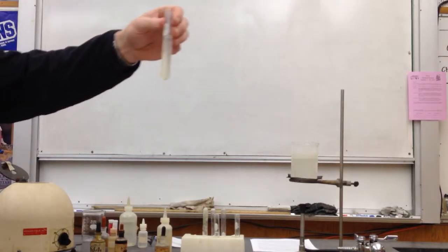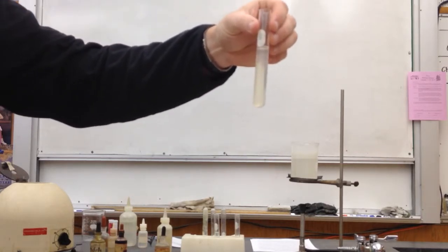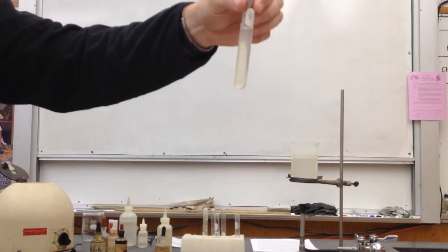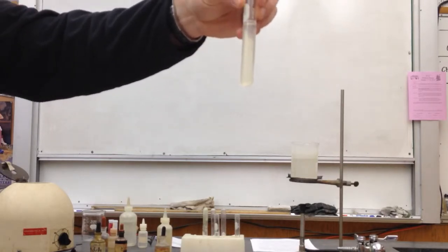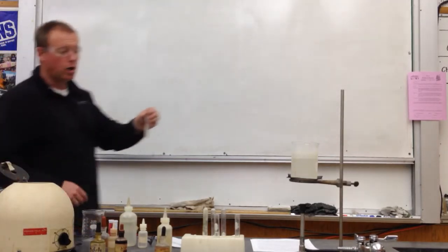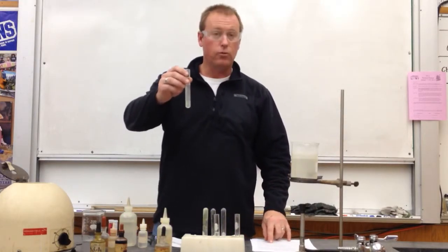This precipitate is flocculent. It's fluffy, it's floating there, it's not nearly as heavy as precipitates that you've seen before with things like lead and mercury and silver. It's kind of a jelly-like precipitate that's just floating there, and it's going to take a long time before it settles. So as I centrifuge this, I'm going to need to centrifuge for a longer period of time. So to finish step 8, we're going to centrifuge and decant, saving the precipitate for procedure 9.